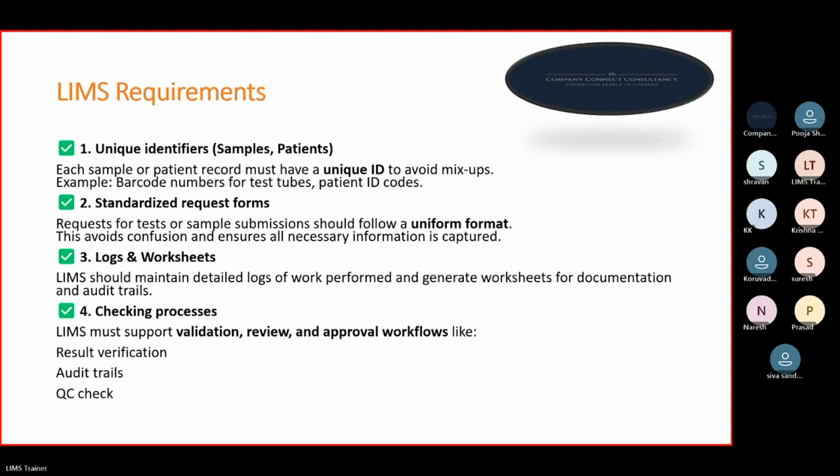So the previous one is completely the development team where the IT people will sit. After testing the production environment, the LIMS consultant role will start, where master data creation... No, your LIMS consultant's role will start in the implementation from the first day. Developing also means we need to understand the requirement from the client, and you will have the developer along with you in your team.